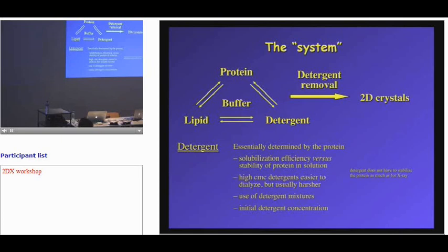You get broad spectra, undergoing conformation changes, instability. But the major question is, if you go back down in the concentration, do you come back to the initial protein conformation? So the idea that, yes, I think the answer is yes. If this is true, then why does it matter if you start with a high detergent concentration or not? It's a little bit a question.